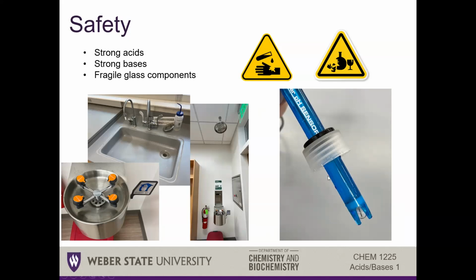Okay. The other hazard is just breaking glass. The glass tips at the end of the pH sensors that we'll be using this week are very, very fragile, so you need to be careful not to break those.